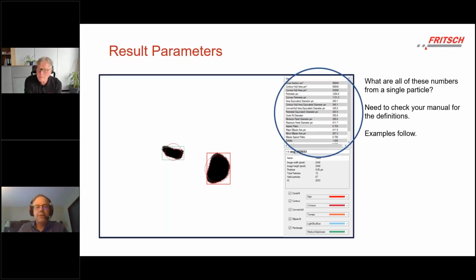And that's a great segue into some details about the measurement and what you're going to see as you make a measurement in practice. A lot of Günther's skill is packed into the instrument, which makes operation much easier.